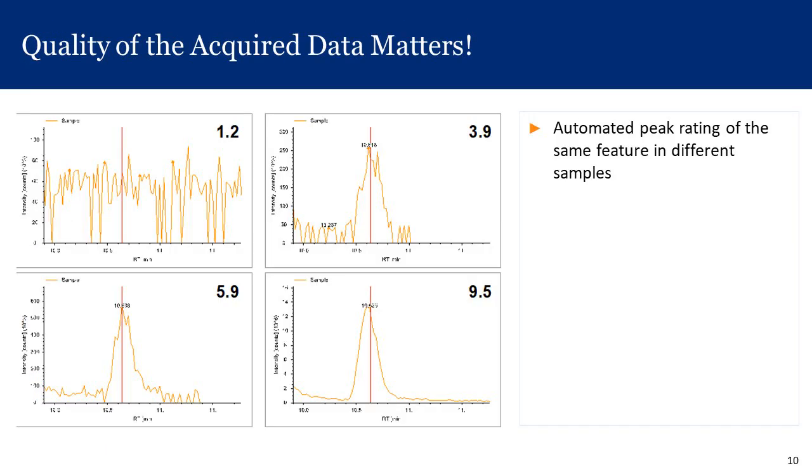One aspect that I want to highlight, and again, this is why looking at the data and really thinking about the quality of the data really matters, is that the software or the instrument doesn't necessarily differentiate between how well each of the ions was detected. So what I'm showing you here is 4 examples of what the instrument or the software detects as different peaks.